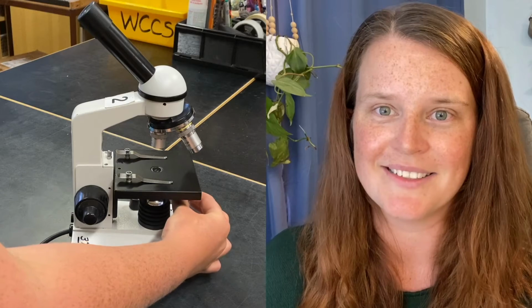The stage is where you place the slide to bring it into focus, and it has a small hole to let light through. Stage clips secure the slide in place, reducing movement. The lamp switch and adjustment knob turn on the backlight to show the sample, and the adjustment knob adjusts the brightness. The diaphragm changes the width of the band of light up through the microscope.